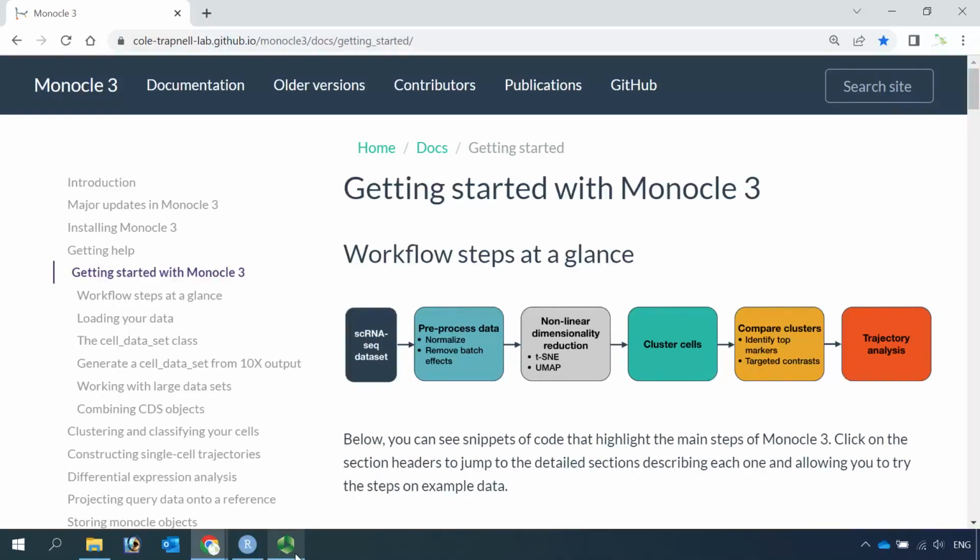You already saw my video about RNA velocity. We can use scVelo to perform trajectory analysis, but the RNA velocity method is more complicated for our users because most packages were developed for Python, and RNA velocity analysis also needs loom files, which are not publicly available for us to download.